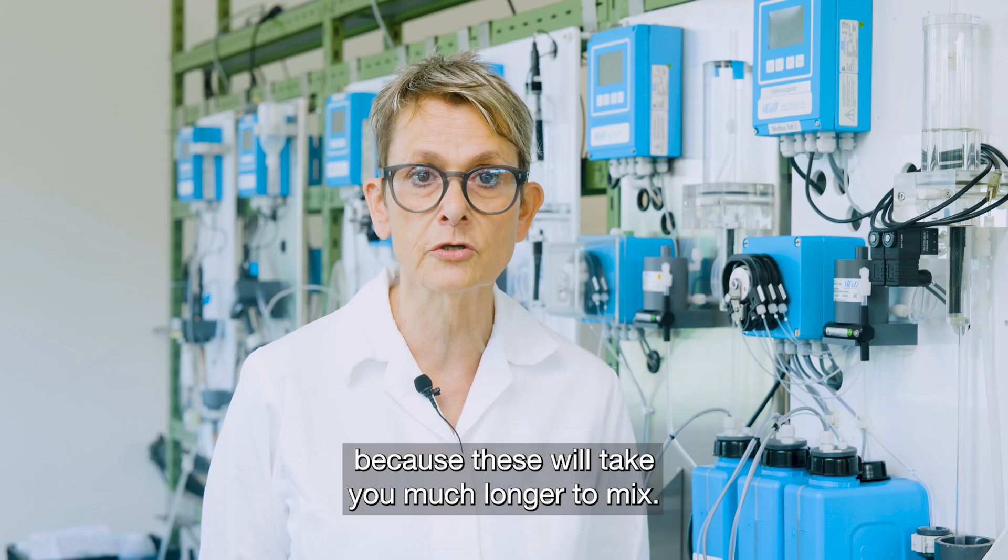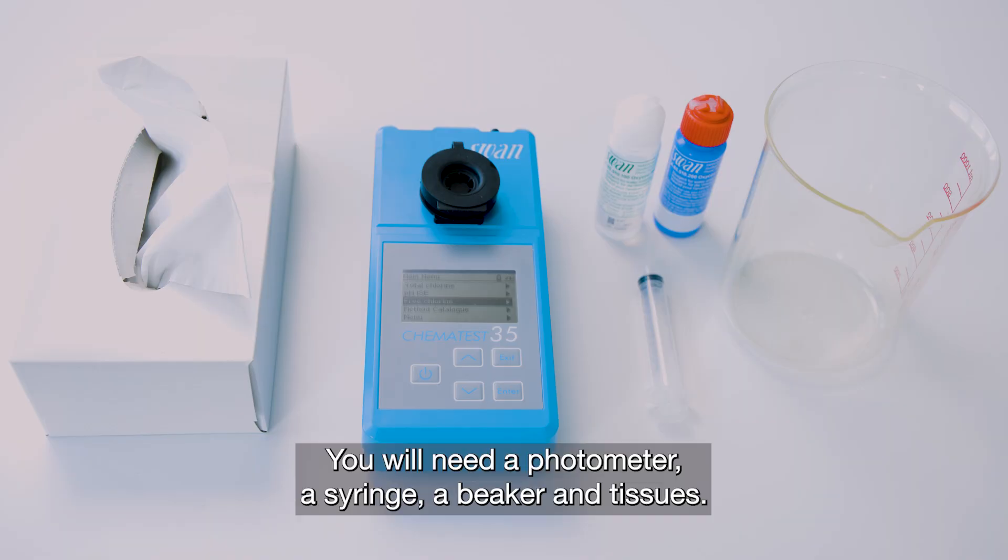because these will take you much longer to mix. You will need a photometer, a syringe, a beaker, and tissues.